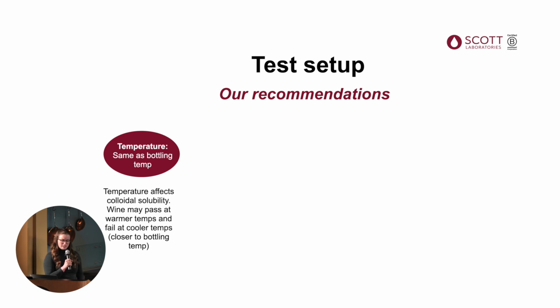And that was Lee's presentation. Traditionally, at warmer temperatures, colloids can be a little bit more soluble. So they may pass through a filterability test, and then on the day of, when your wine is a lot colder, closer to your bottling temperature, it can clog your final membrane. So that's why we recommend doing the filterability test at the same temperature as your bottling temperature.